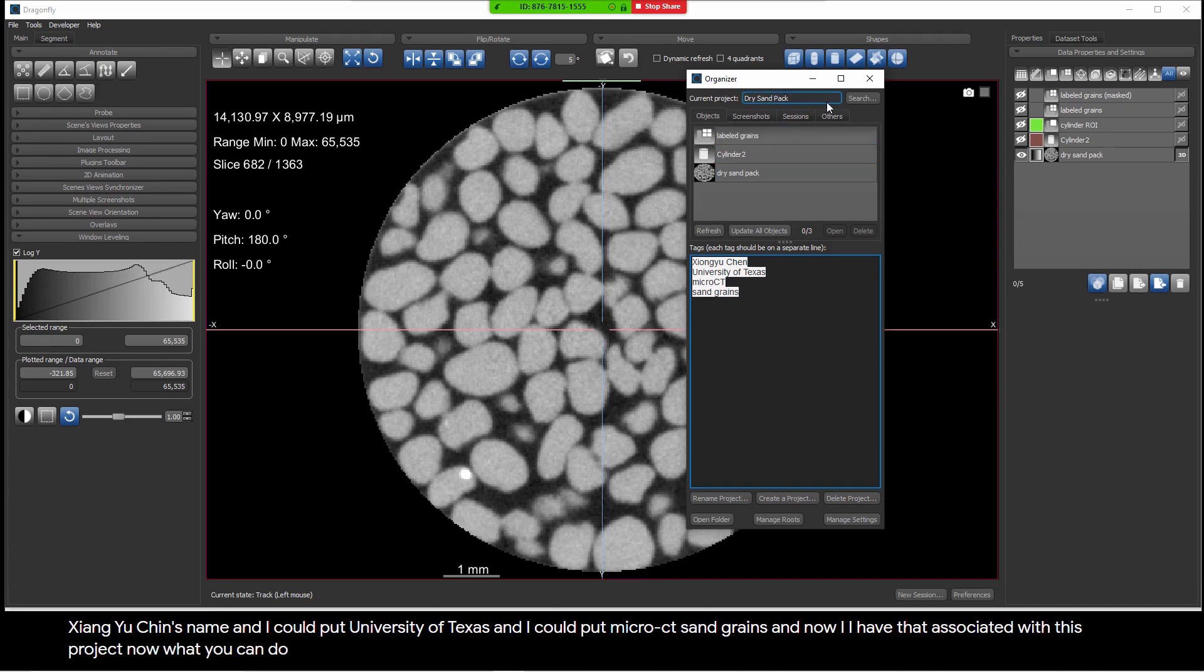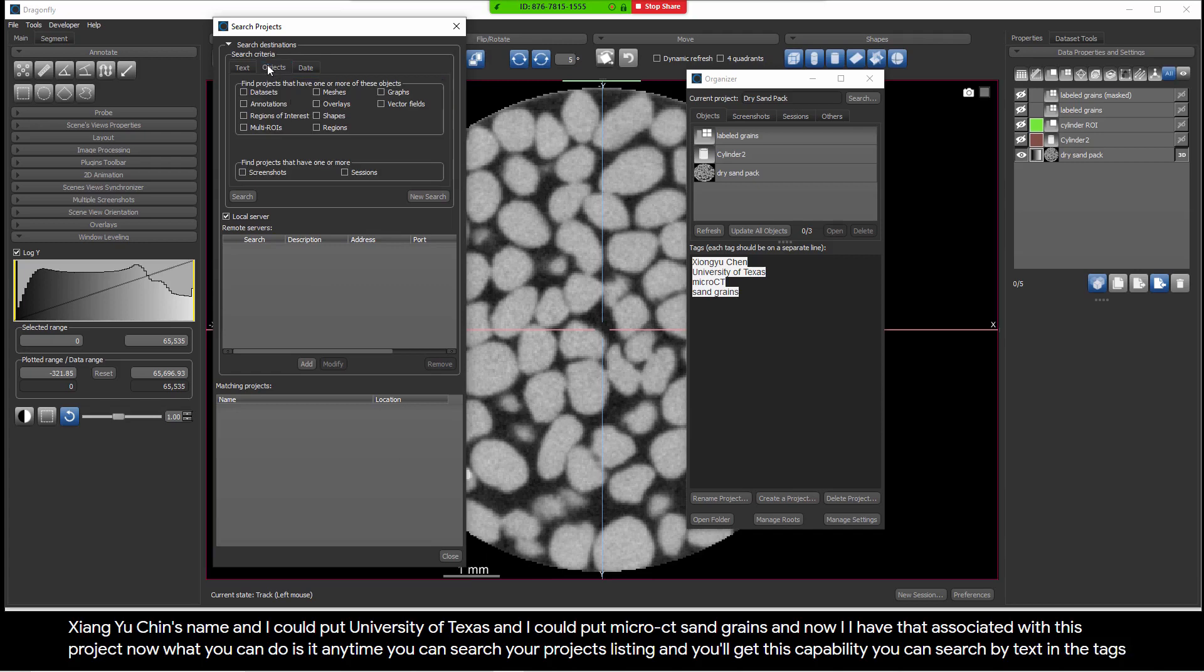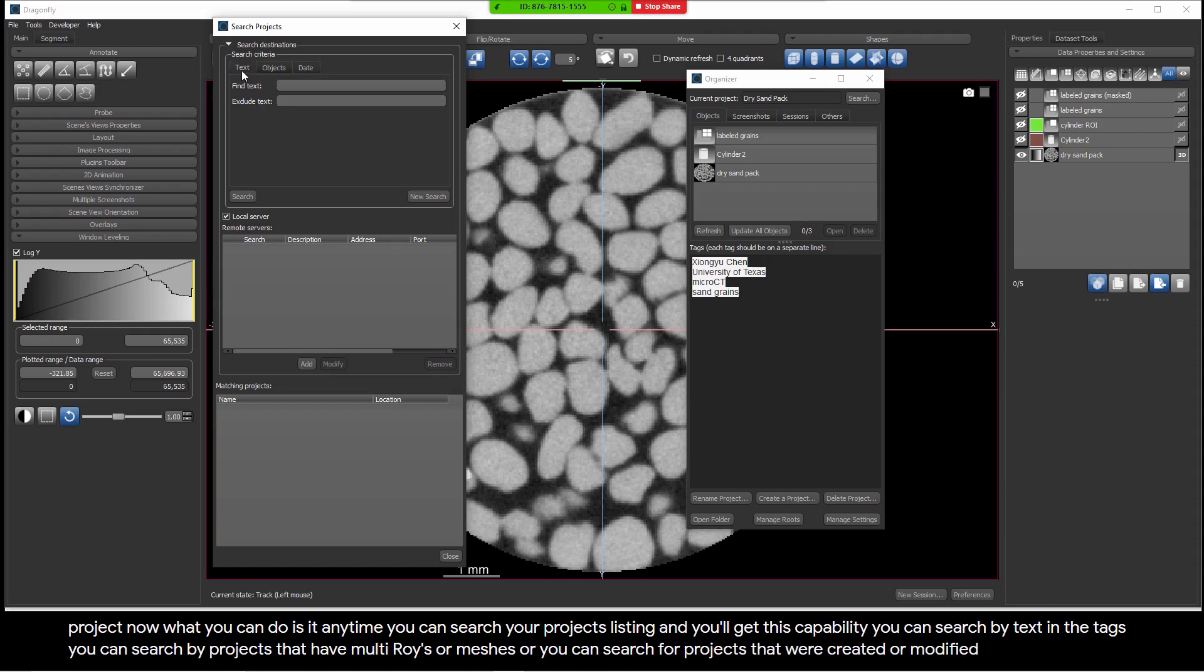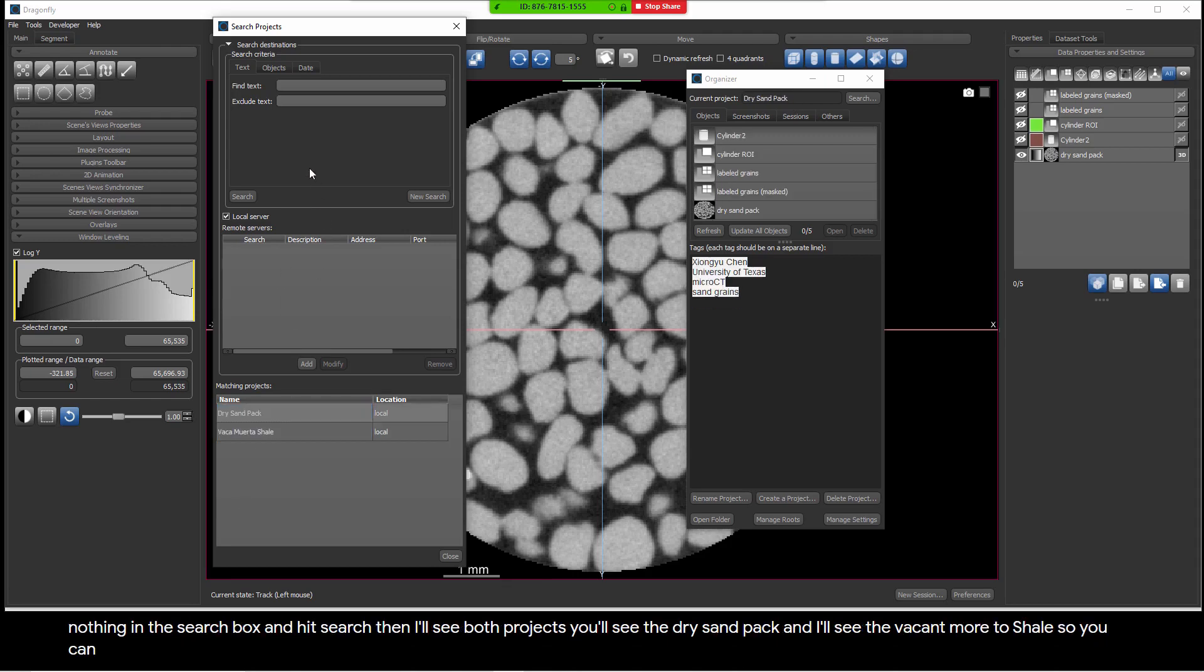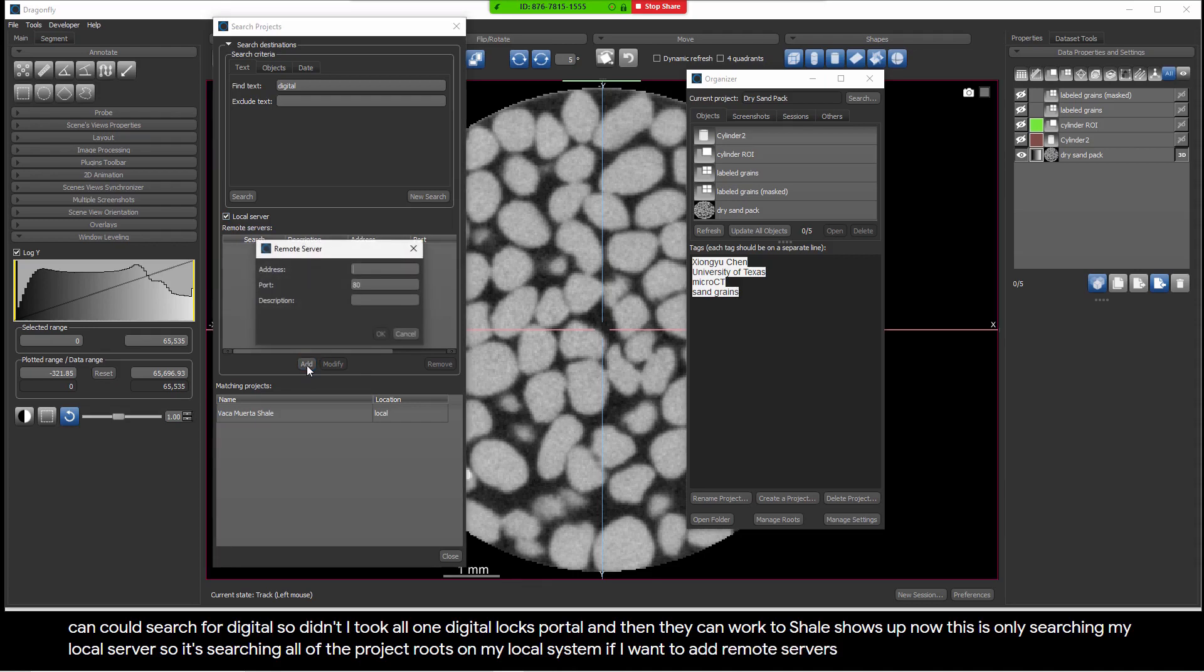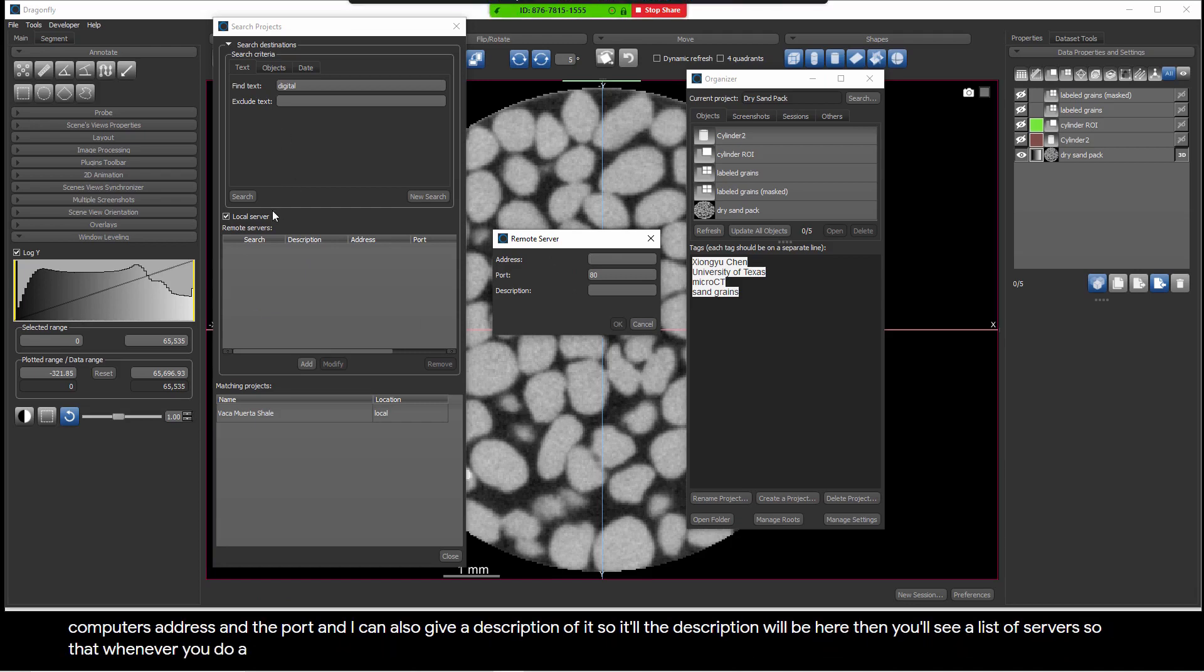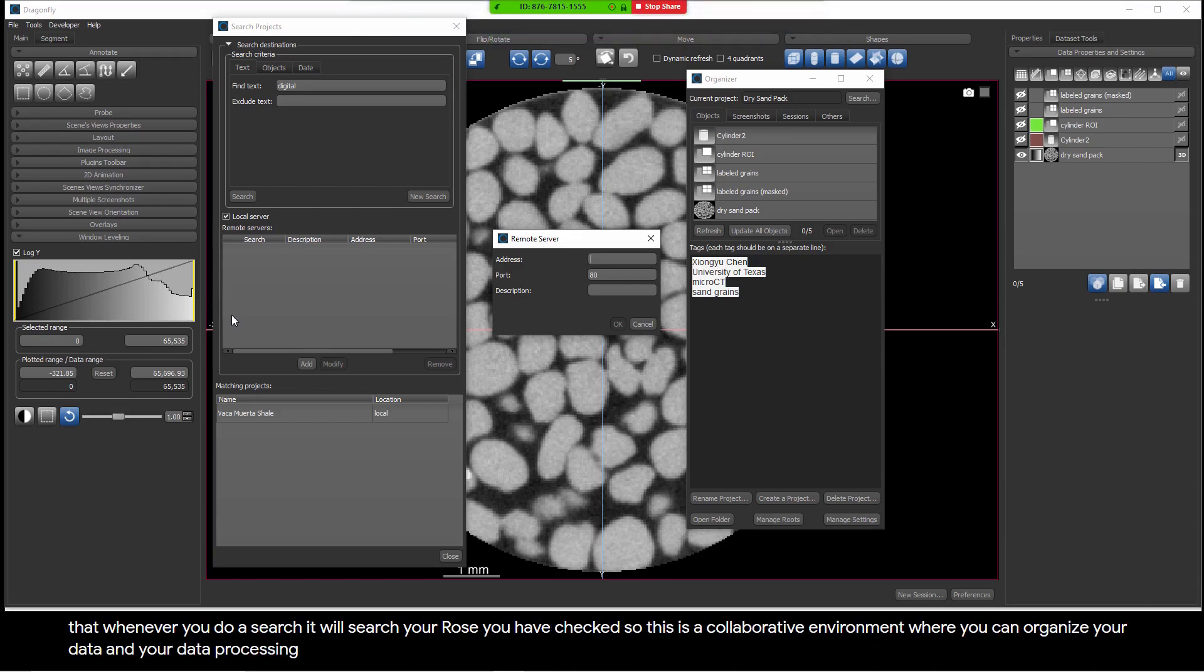Now what you can do is at any time you can search your Projects listing and you'll get this capability. You can search by text in the tags. You can search by projects that have multi-ROIs or meshes. Or you can search for projects that were created or modified. Now if I just put nothing in the search box and I hit Search, then I'll see both projects. I'll see the Dry Sandpack and I'll see the Vaca Muerta Shale. So you can browse through the different projects this way or I could search for digital. And then Vaca Muerta Shale shows up. Now this is only searching my local server. If I want to add remote servers, I can add the server by giving that computer's address and the port. Then you'll see a list of servers so that whenever you do a search, it'll search your local server and then whatever remote servers you have checked.